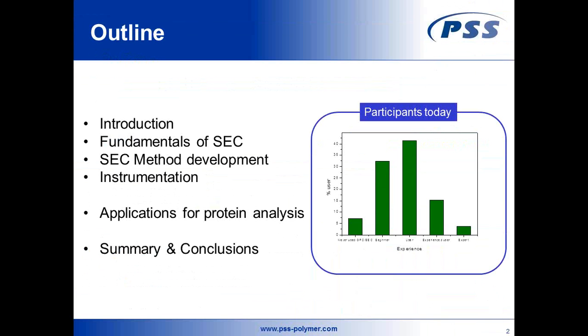I will also talk about instrumentation, what kind of additional detectors can be used and what they are good for. And at the end, and this is pretty much the last third up to the second half of my talk, I am going to show you a couple of applications for protein analysis using SEC, and of course at the very end, last but not least, I will summarize and conclude what we have talked about today.